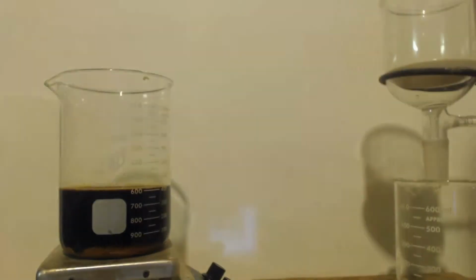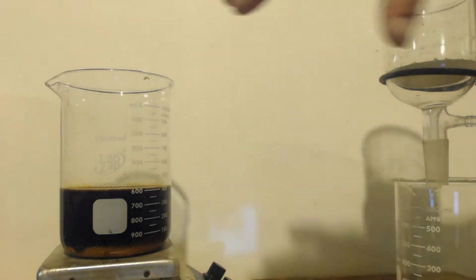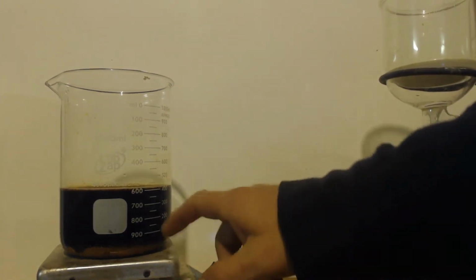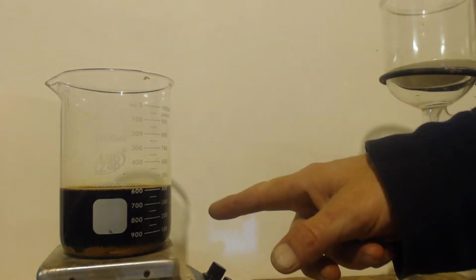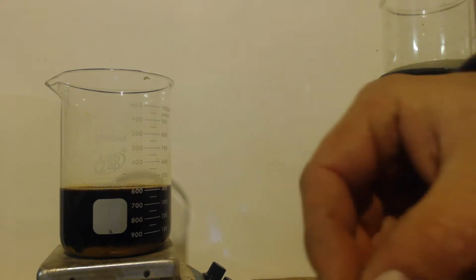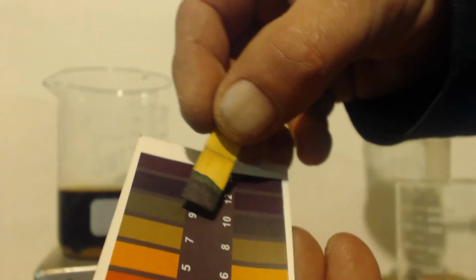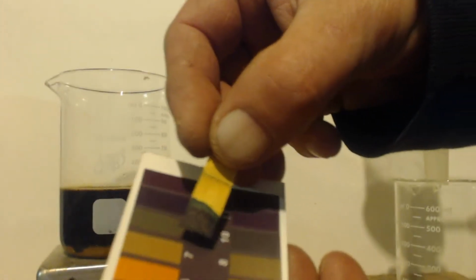Alright, right after I went off camera, I added 200 milliliters of really hot water, because this heater doesn't work, it just stirs. So I heated it up on the stove and poured it in here to get it hot. It's been stirring maybe 15 minutes. It's got a pH of, let me see here, 9. Somewhere between 9 and 10. I don't know if you can see that or not. It's hard to tell on camera, but it's somewhere between there.